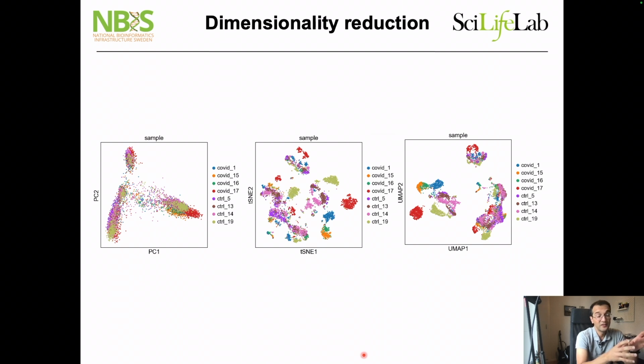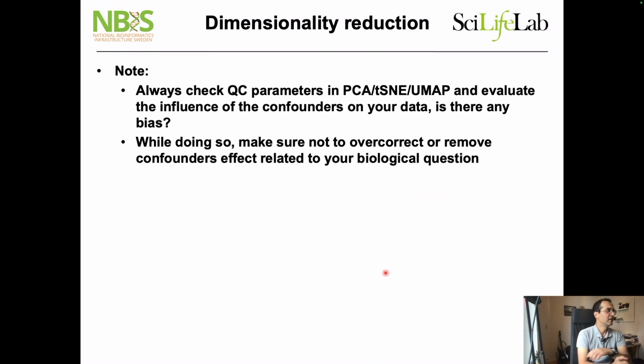So still there could be some overlap between them, but we may have batch effect. That's the point that I'm trying to make, that when we do not control for the batch effect, we may treat these samples as showing very different expression profiles. But in data integration, we can see whether it has a different picture or not. Thanks, it was an interesting point that you highlighted.